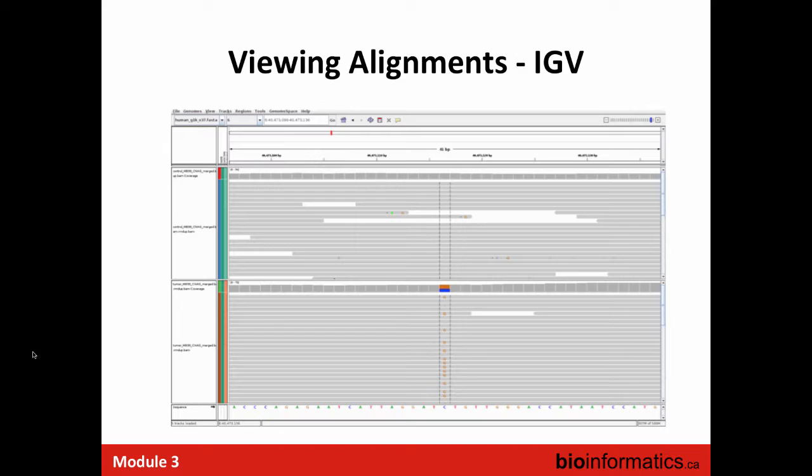Right, so I believe you all had a tutorial on IGV already. Is that right? In the module coming up, where you will run BWA and use SAMtools, we'll be using IGV to view the aligned reads. IGV gives you a lot of information about the reads. All of these fields are in the SAM file, like where the read was mapped, where a pair was mapped, and so on. And you can view the mismatches between reads and the reference genome.